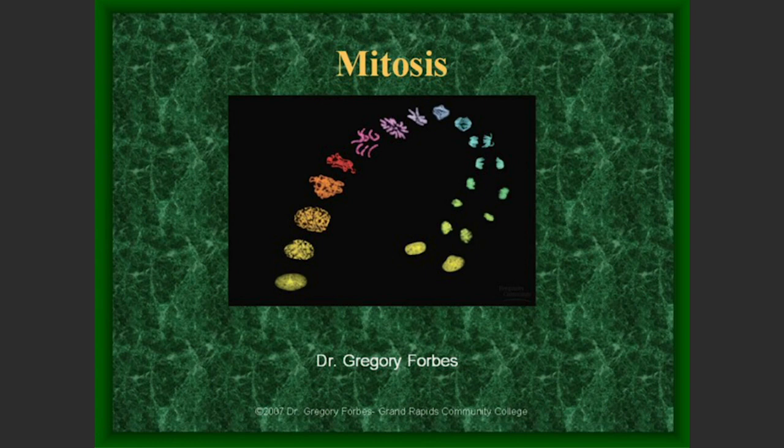So the other objective of having you be able to identify mitotic cells or different stages of mitotic division is it also allows you to take a look at the change in chromosomes as the cell goes through this nuclear division. So once again, the details of mitosis are really going to happen in lecture. Check your SPOs and find out exactly what features of mitosis you're responsible to know, but I can guarantee you we do want you to know the individual stages of mitosis and be able to identify them. In lecture, you'll talk about the details of what's happening in each of these stages.